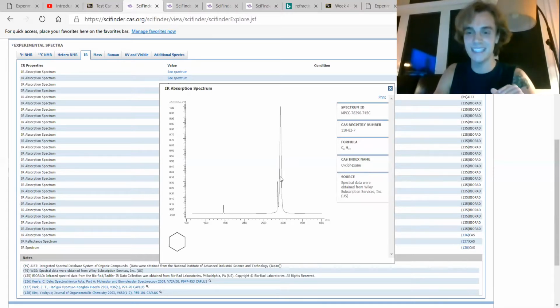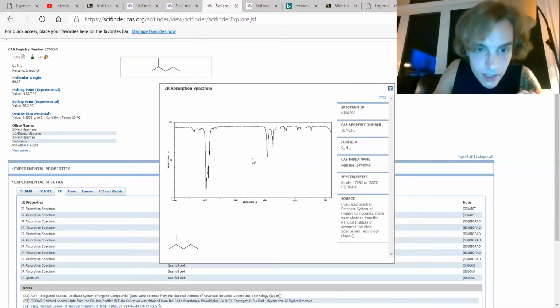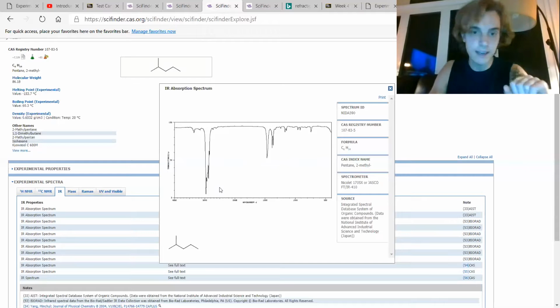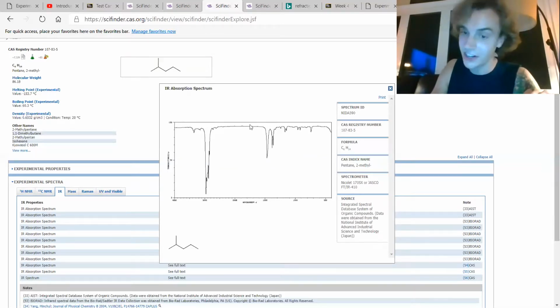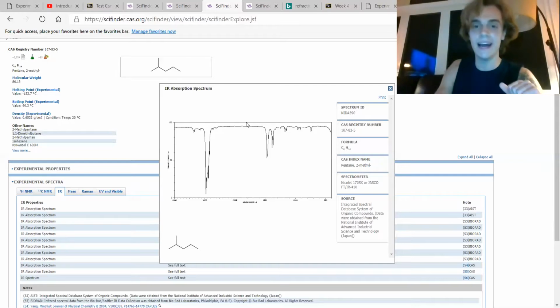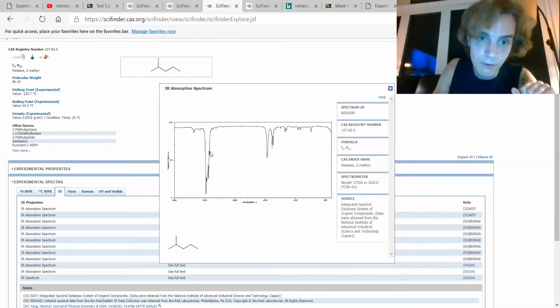Now, that is something definitely to reference in your reports. Now, moving on, we have 2-methylpentane. Now we see the same exact result up to 3,000, switched, inverted on the y-axis, switched to face downwards. So now we see this 3,000 point on the wave number axis with this lesser peak coming even further up the peak of the 3,000 point.